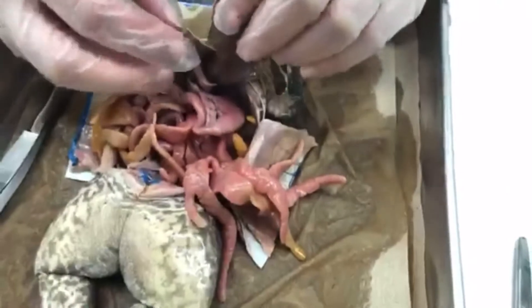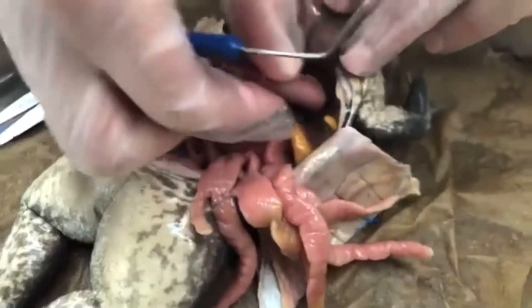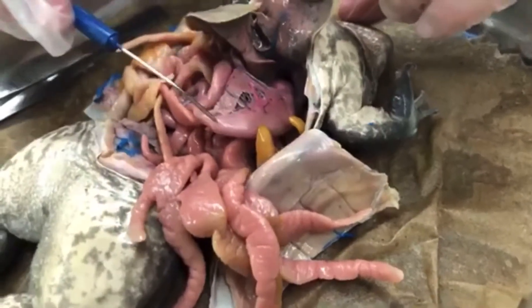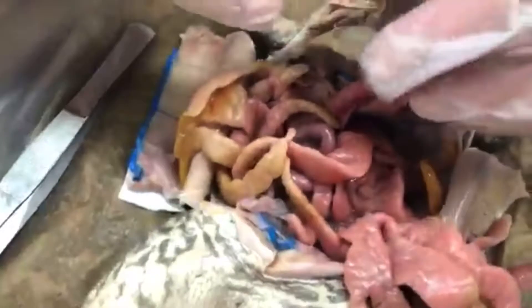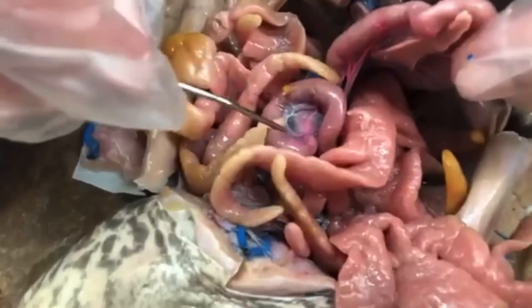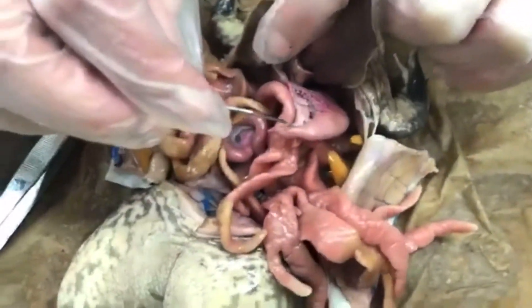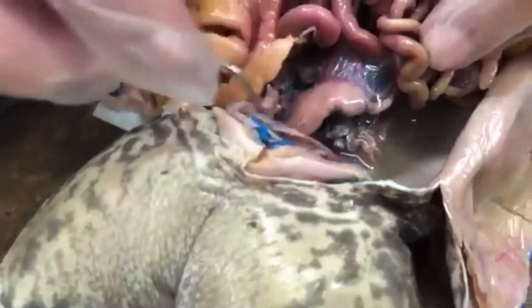Let's move our liver out of the way and see what we've got underneath. This structure here is the stomach - it feels pretty firm, there might be something in there. And if you follow along, it's attached to our intestine. If we move some of these fat bodies out of the way, you can see the smoother, squiggly shape - that's the intestine. So it goes from the stomach to the small intestine, and then way down underneath we would find the large intestine.